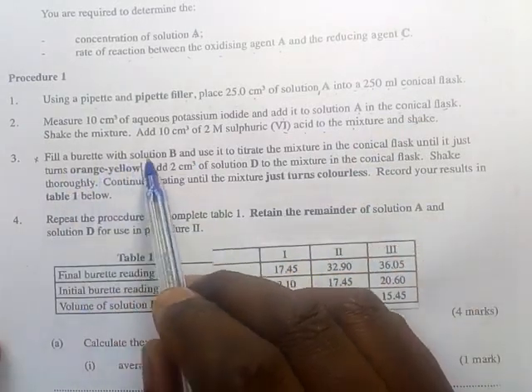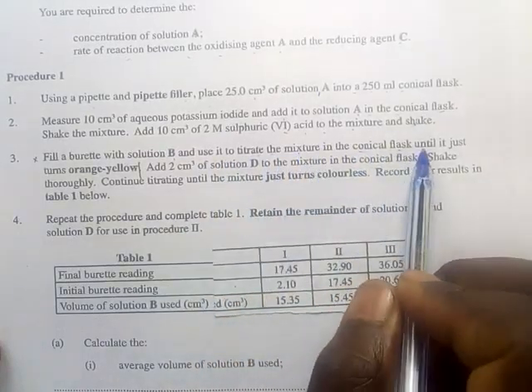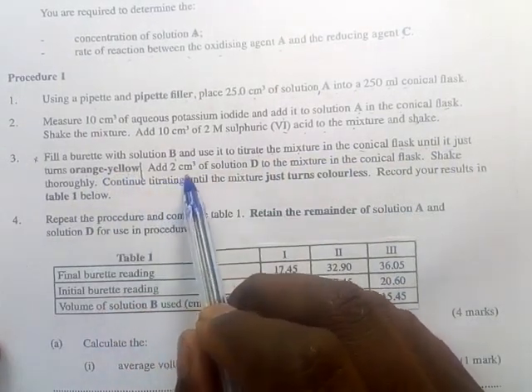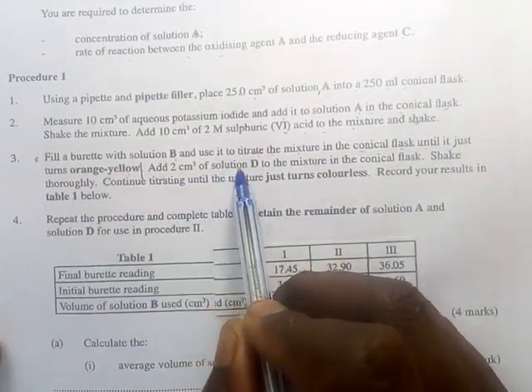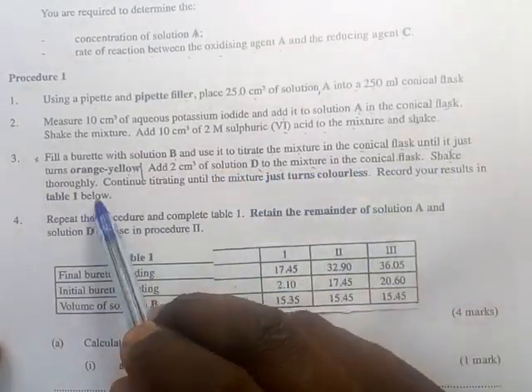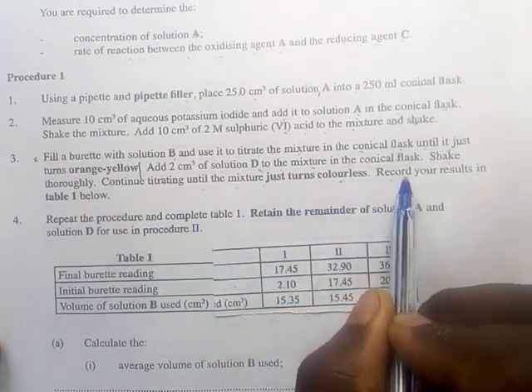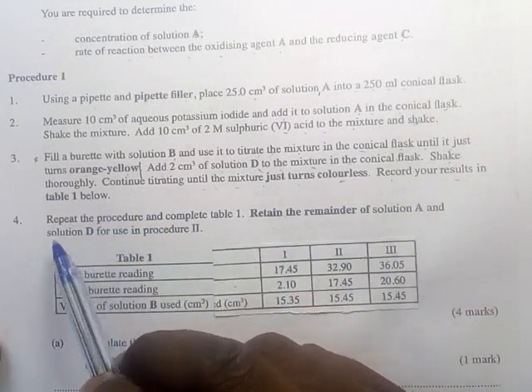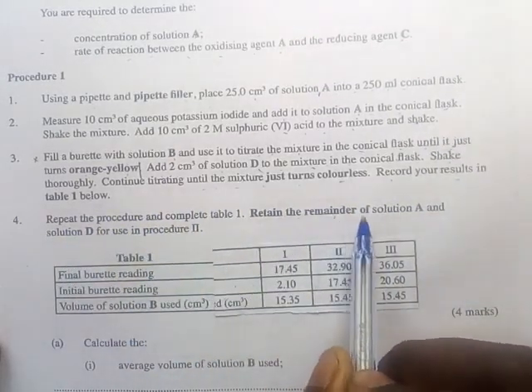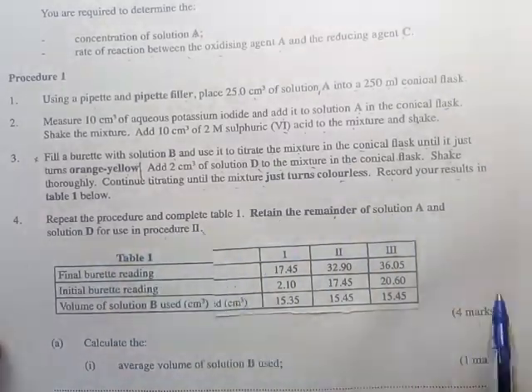Fill the burette with solution B and use it to titrate the mixture in the conical flask until it just turns orange yellow. Add 2 cm³ of solution D to the mixture in the conical flask. Shake thoroughly. Continue titrating until the mixture just turns colorless. Record your results below. Repeat the procedure and complete this. Retain the remainder of solution A and solution D for use in procedure 2.